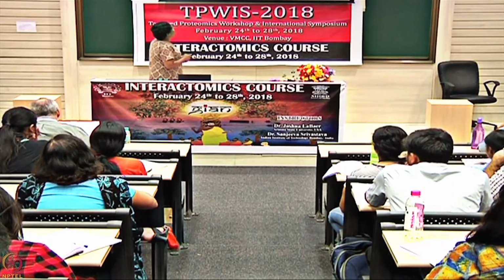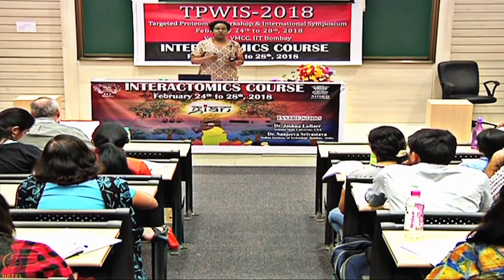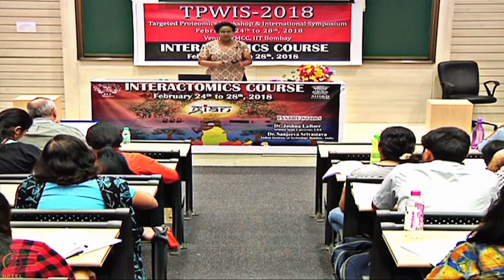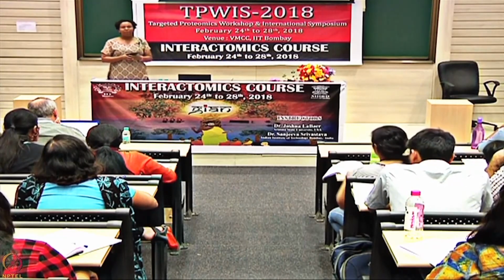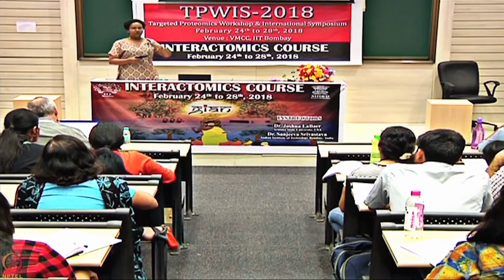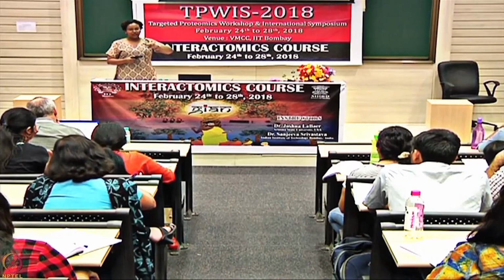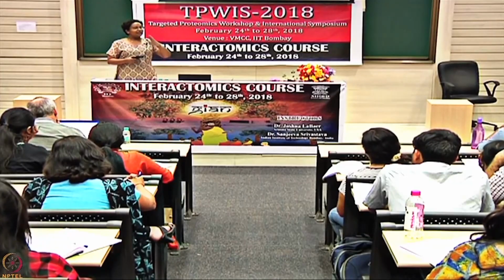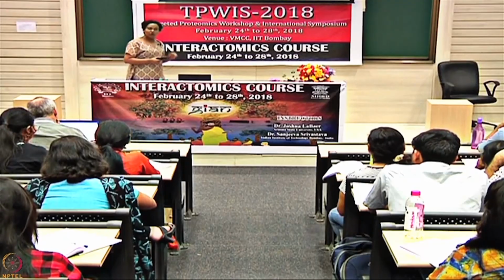So, there is a wizard that we have, which we call the control wizard, and when you set up your immobilization, you can say aim for immobilization, rather than putting a contact time for immobilization. When you do so, your system pulses small volumes, say around a microliter or so, on the surface and does a pre-concentration for you. And with the rise in the RU, it calculates whether you can attain whatever you have aimed for, around 600 RUs. It will let you know in the first 5 to 6 pulses whether it is attainable or not.